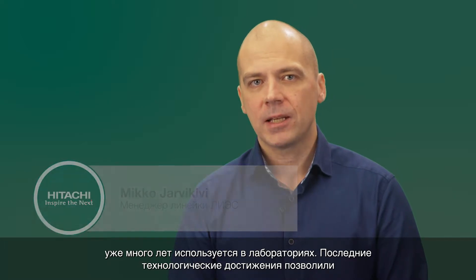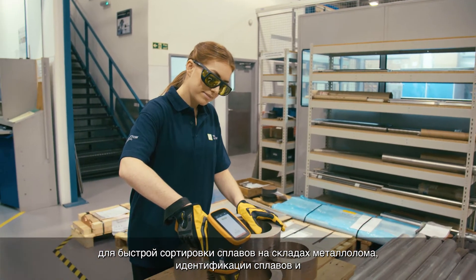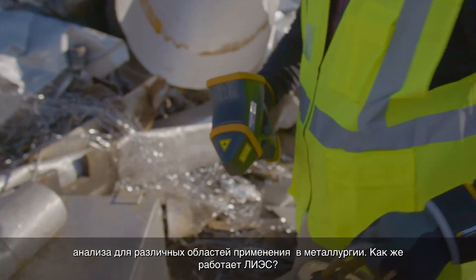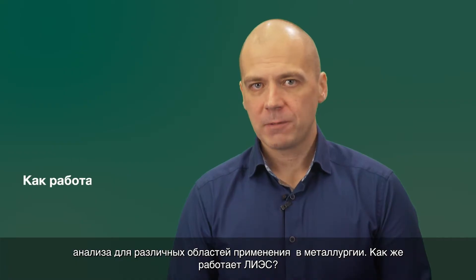Laser-Induced Breakdown Spectroscopy, or LIBS, is an analytical technique that has been used in laboratories for many years. Technological advances have made it possible to shrink LIBS into a handheld version. Most handheld LIBS analyzers are used for fast sorting of alloys in scrap yards, and alloy identification and analysis in various applications within the metals industry.